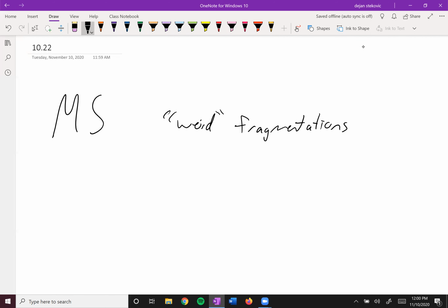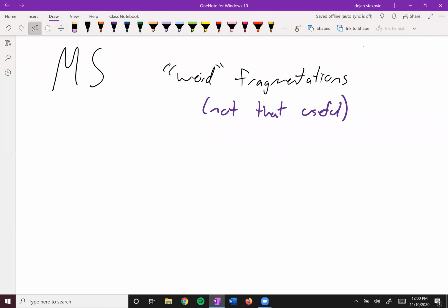So we saw in the last section that when molecules fragment, it's often very logical and makes sense. Other times it's not as logical and doesn't quite make as much sense. And so we're just going to take a look at some weird fragmentations. Overall, these are not going to be that useful. We'll have better ways we can identify these functional groups. But all the books show this, so we're going to go ahead and just learn it, but it's not really going to be a main thing.